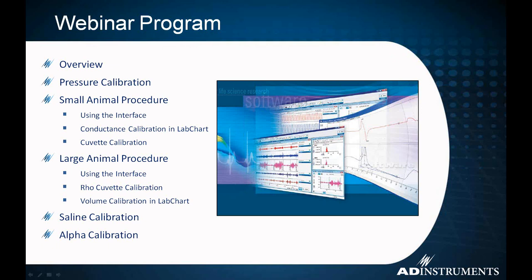Moving on to the meat of what we're going to talk about today. First I'll give a general overview of the MPVS Ultra control software. We'll talk about pressure calibration. The pressure calibration steps are identical for small and large animal procedures. And then we'll talk about small animal volume calibration procedures and large animal volume calibration procedures. There are some very large differences that we want to cover.